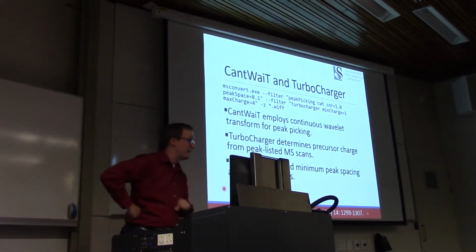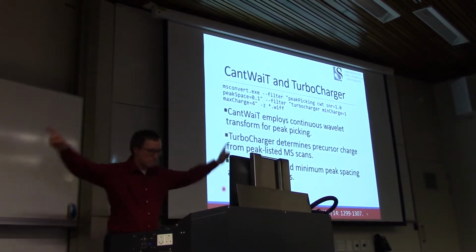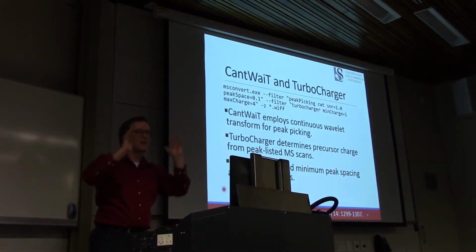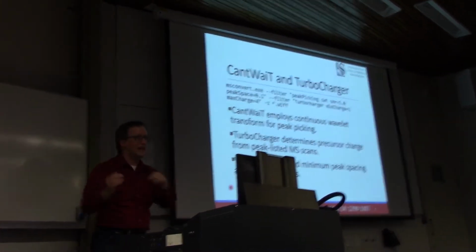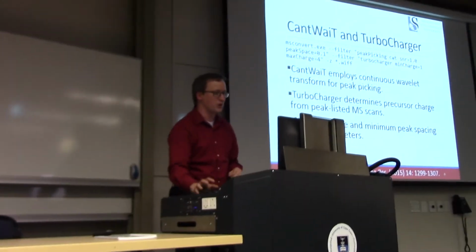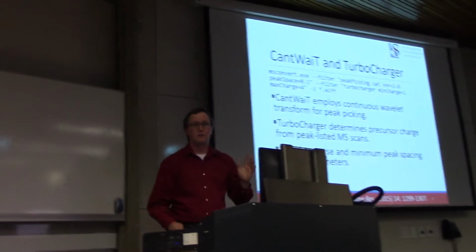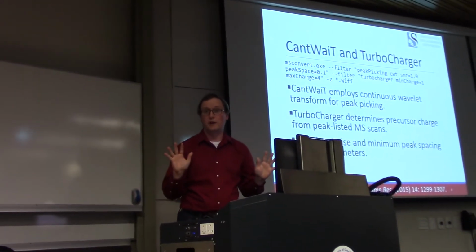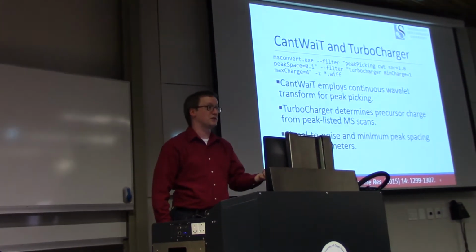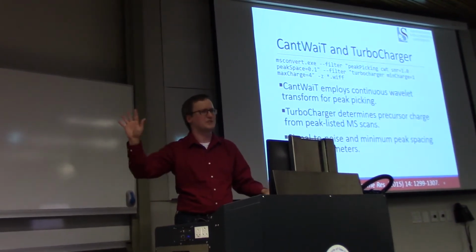We used Mexican hat wavelets. There's that term again. So we have a wavelet matcher that attempts to find peaks out of these functions of intensity and m/z. We were a little snarky when we wrote this software. We decided that we could no longer wait on high-quality peak pickers from some mass spec companies. SCIEX was not the problem here.